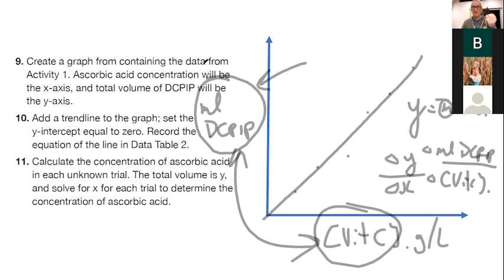It's messy. That change in color is tricky. Remember, as you noticed, it was clear, and then it got yellow, and then it got really yellow, and then you get this sort of greenish, almost like a bronze green color. You want to get as close to that yellow color as possible. Basically, you just want to have like one drop added, and it changes color and then it stops. So be constantly stirring, always be swirling that around.